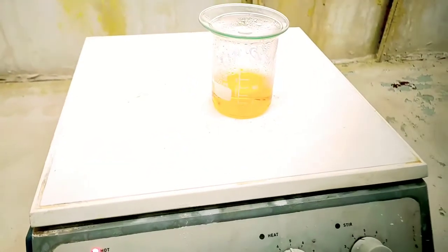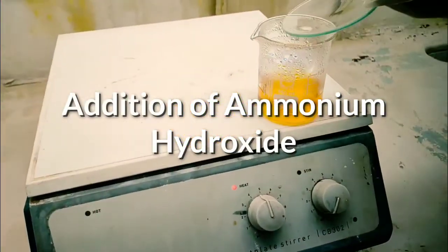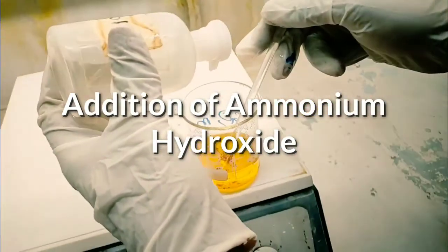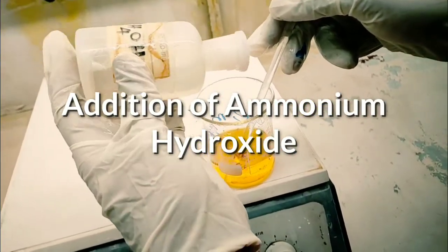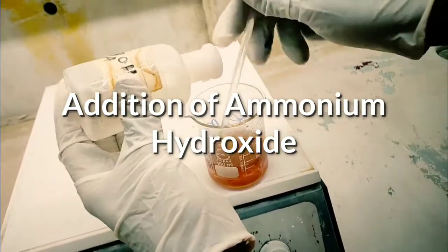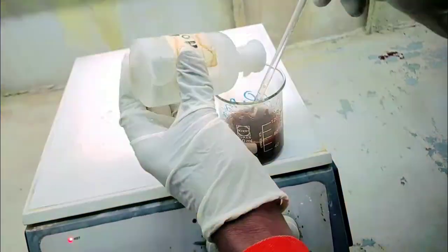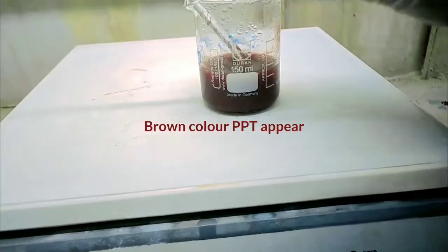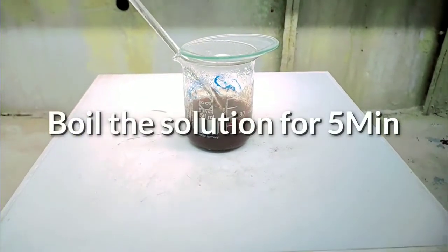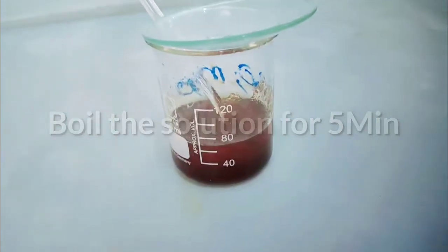Place it onto the center of the hot plate. Add ammonium hydroxide until brown color precipitate appears. Boil for five minutes and keep for settling down.